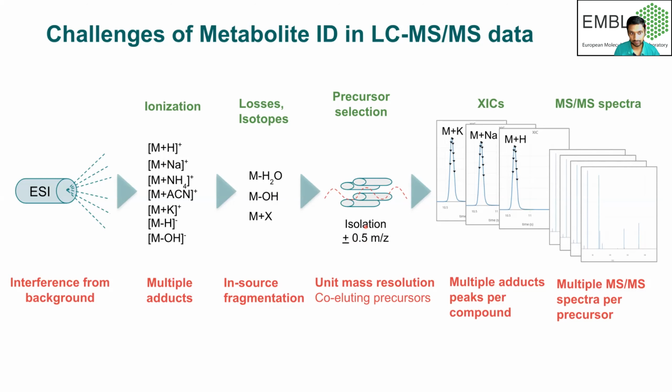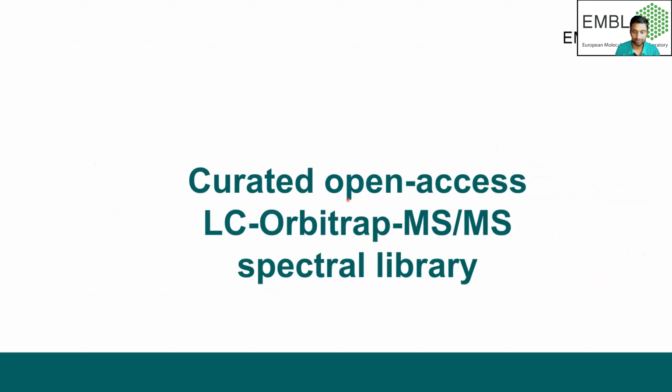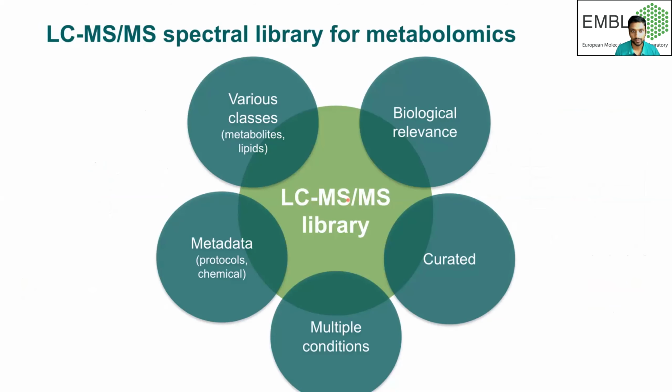So it cannot filter out closely related peaks, and you will get fragments which are contaminated by other peaks or other adducts. That way the spectra you get from the libraries, or even from running a complex sample, are way more complicated and not interpretable theoretically. That's why metabolite identification is still a very painful and very time consuming process. So the best way to approach it, and how we approach it, is that we generate our own spectral library.